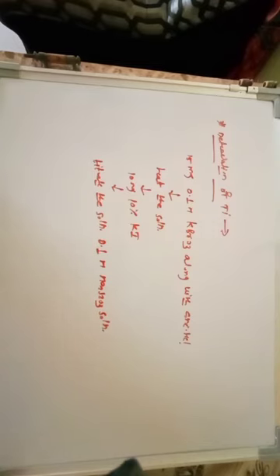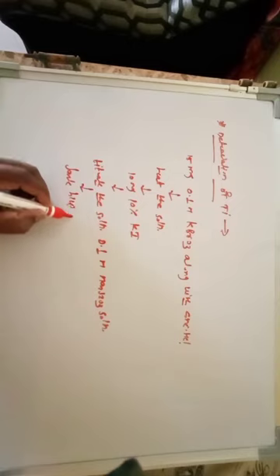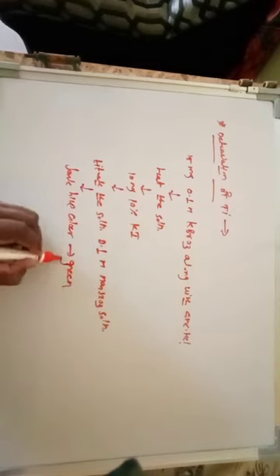We already know that the endpoint of this titration is when the dark blue color changes to green. That is your endpoint of the titration.